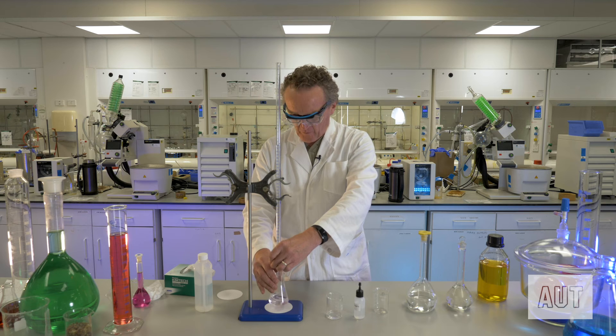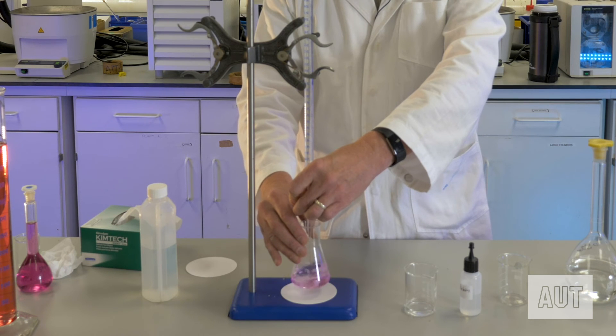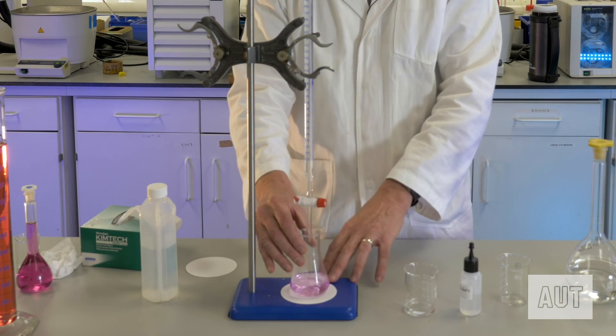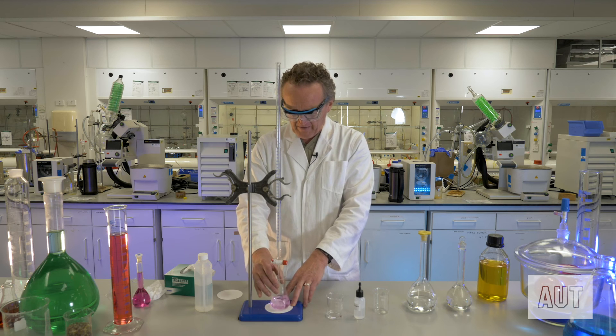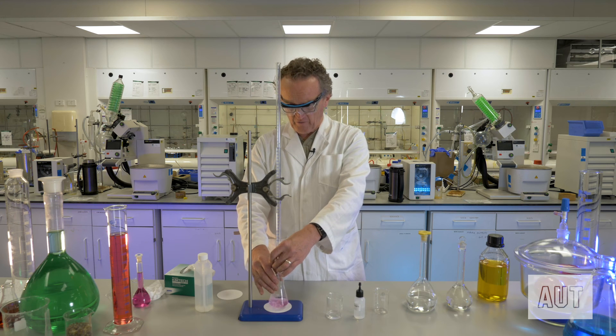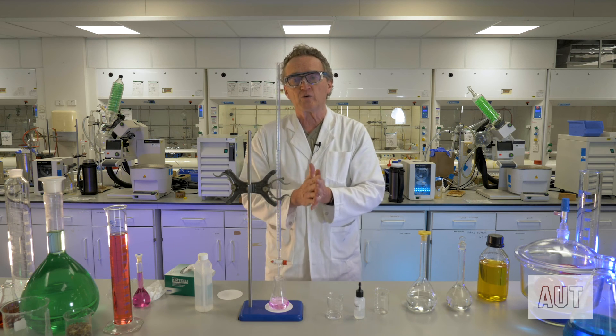Let's add another drop or two just to ensure we're there, because the colour is very, very pale. As you go past the end point you can see it's getting darker, so we're confident that first very pale colour was in fact the end point. We've gone probably five or six drops past it now. That very pale pink you saw originally was the end point — all you're doing now is adding extra sodium hydroxide and making the solution more and more pink.